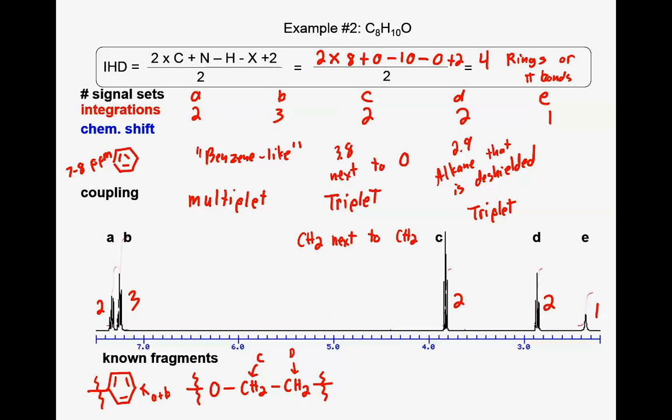More interestingly, what's the splitting of this proton? It's a singlet, but it doesn't look like any singlet we've seen thus far. How's it different? Yeah, it's fat, right? It's a fat signal, and what this indicates is that it is a special kind of signal. So it is a singlet, but importantly, it is very broad, or fat, whichever you like. Anytime we have a very broad singlet like this, it indicates we've got either a proton connected to an oxygen, or a proton connected to a nitrogen, right?